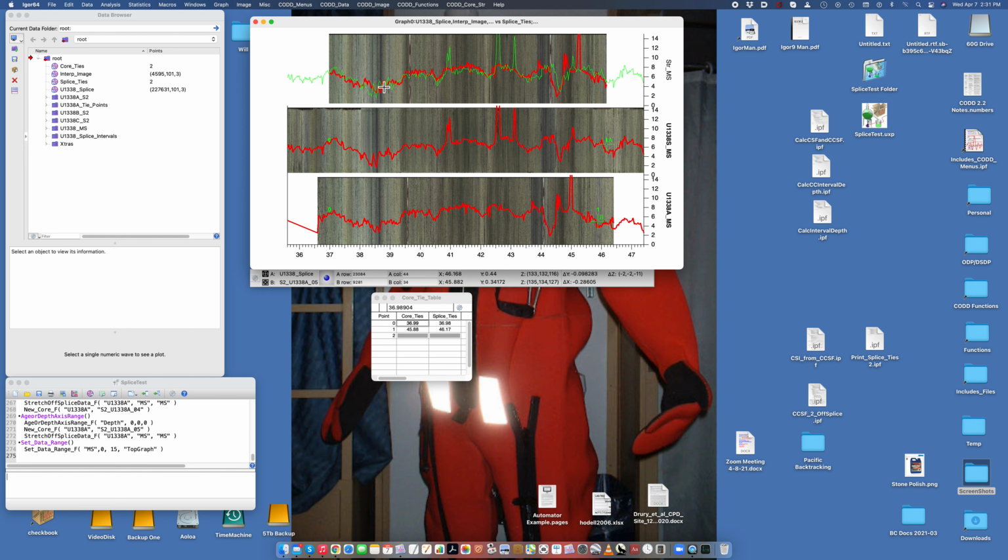Okay, so now we can make the minor adjustments in between the two that we just did. So let's take this point. And I think maybe, looks like those guys are probably this. Well, let's just mark that guy. And then we've got this little guy here, so let's put that guy there. And let's do this guy here.